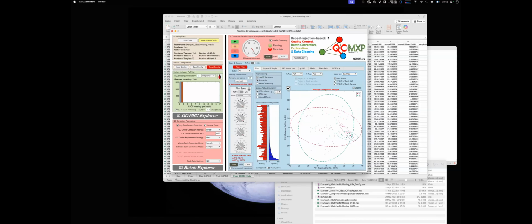The first one is, if you use the D ratio, is there any reason to use the sample RSD filter? Nope. Yeah, that was it. Now, I've put it there. I mean, what I wanted to do was give everybody options that they might like. Some people don't like the D ratio because it's quite brutal.